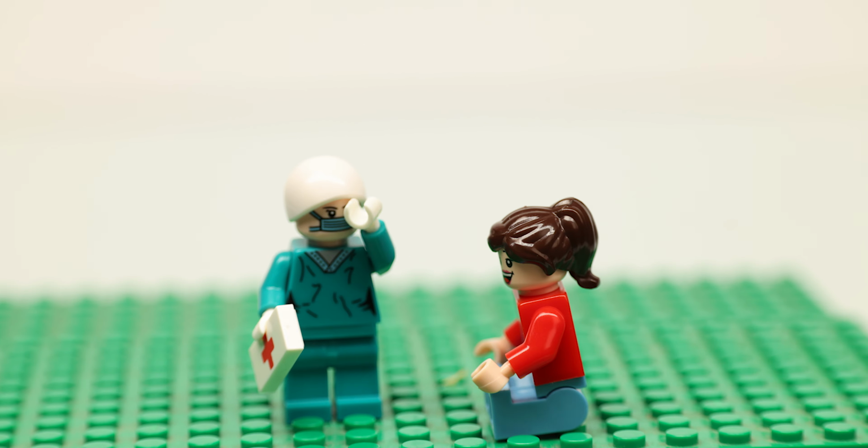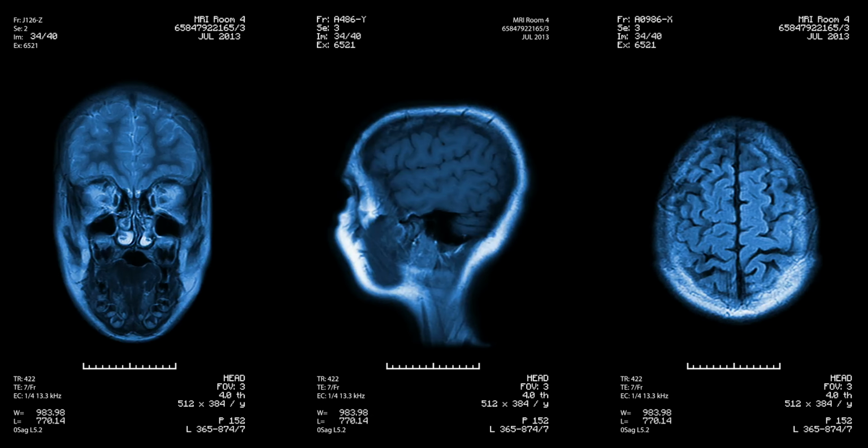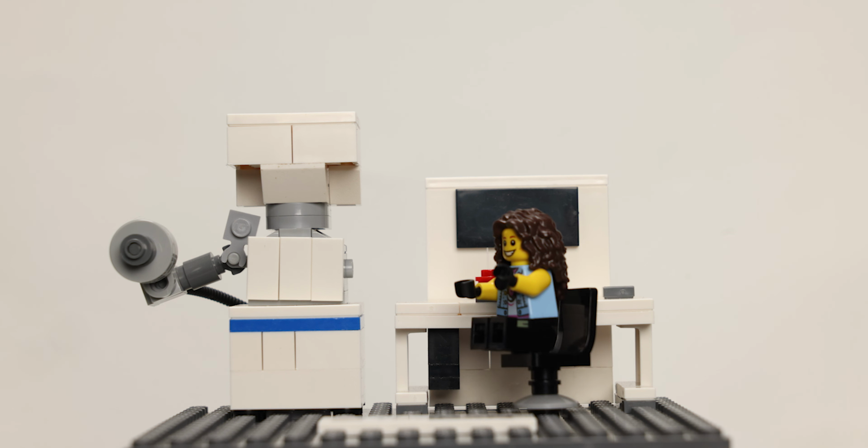Have you gone to emergency care to get an X-ray or CAT scan before because you broke your bone? It's the same idea, but instead of a 2D flat image of your bone, we can obtain a 3D volumetric representation of your bone. This specific machine can do very fast scans while capturing important levels of detail about a material, and it can be used to scan a range of sizes of materials.